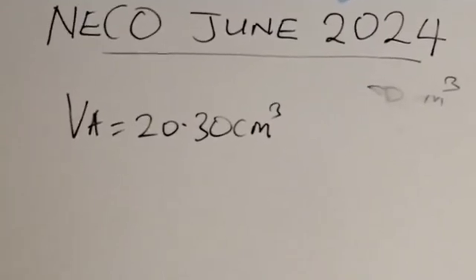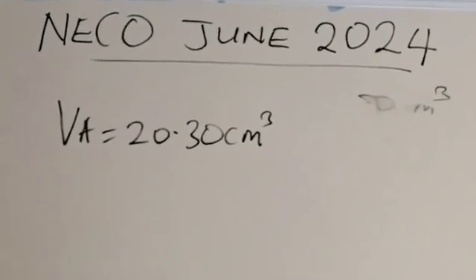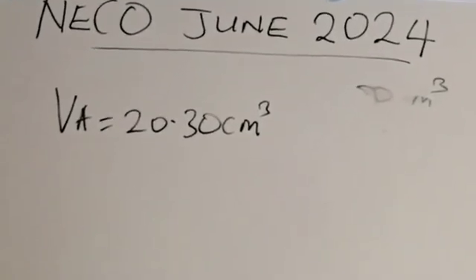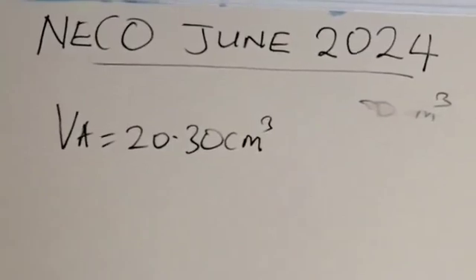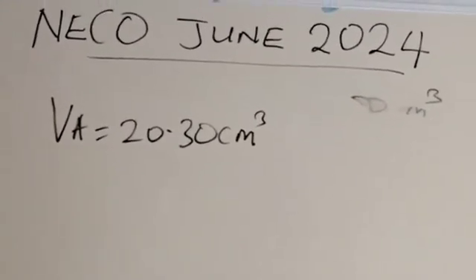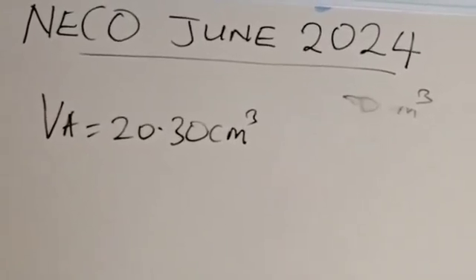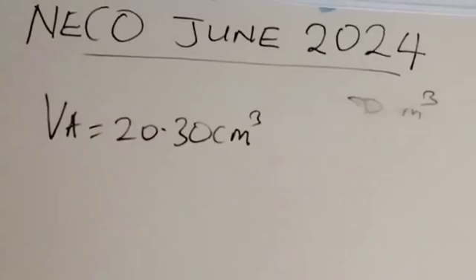If your teacher gave you a different value, then use your teacher's endpoint, because you're going to be evaluated or marked based on your teacher's endpoint. Your teacher is going to fill a report form, and in that report form he's going to write his own endpoint. He writes 21, he writes 22, he writes 24. They're going to adjudge you based on your teacher's endpoint.